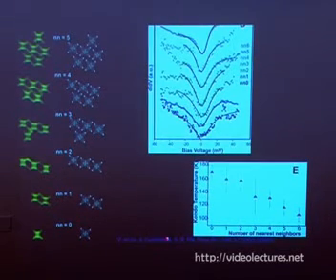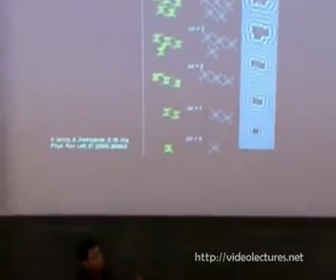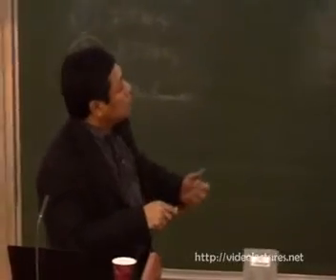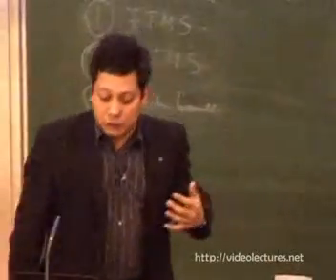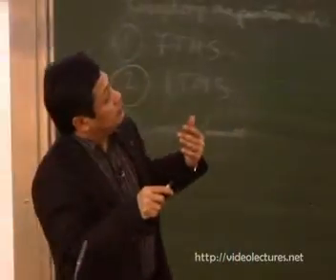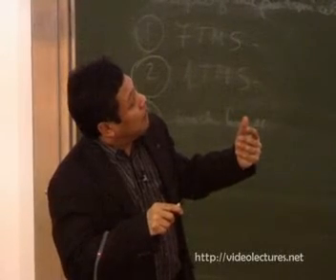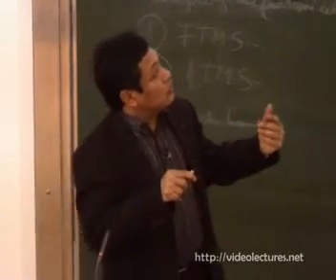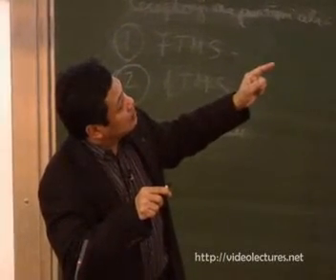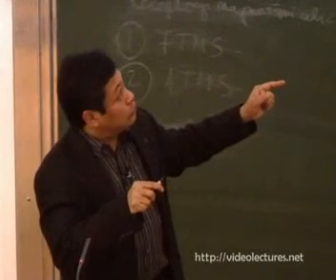Now we need to explain a little bit more physics. It turns out that when we calculate the standing wave patterns, as I explained before with the IJS logo and other atomic manipulation, we have this kind of standing waves. Standing waves are produced by the free surface state electrons. This is a calculated image. In the molecular clusters there are no standing waves, but outside, yes. So the edge molecules scatter the electrons, and the center molecule should be around here. It doesn't have contact with the standing wave surface state electrons.